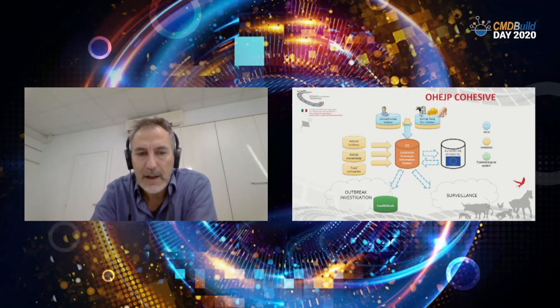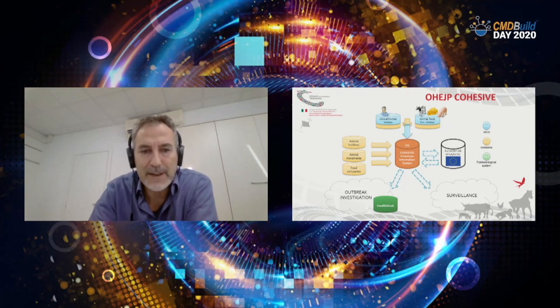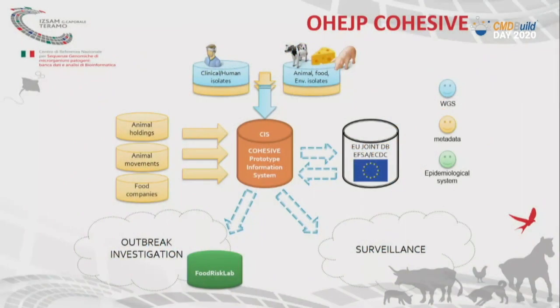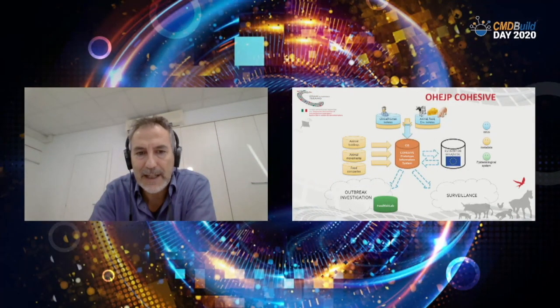As you can see, one member state can use it to combine information from the public health pathogen databases, to simplify, on the top left, together with the veterinarian information systems on the right, in one system, again improving the metadata with the yellow boxes on the left, in order to provide outbreak investigation, surveillance, and of course, reporting to the European level agencies.